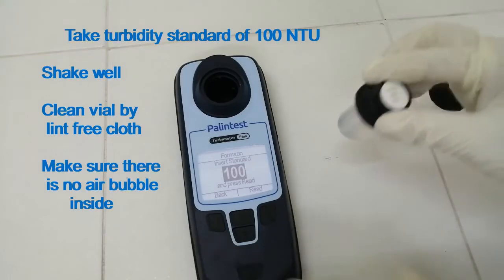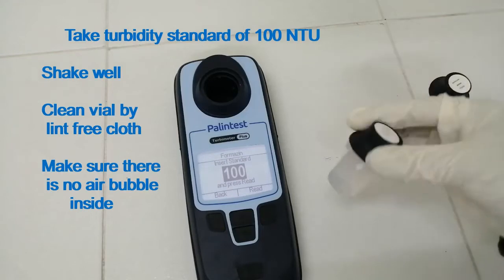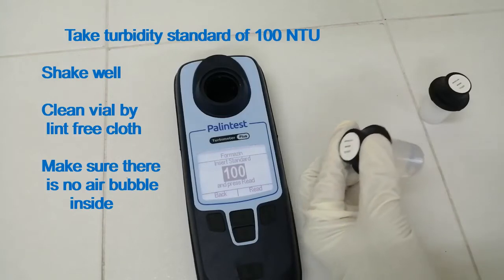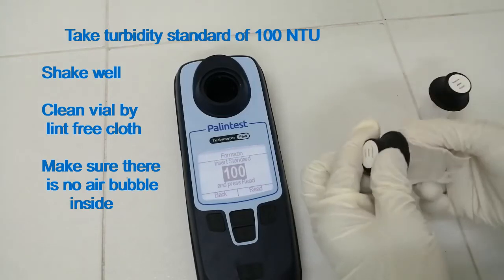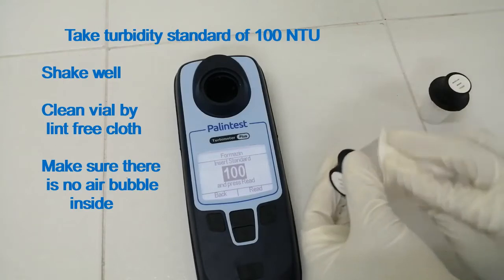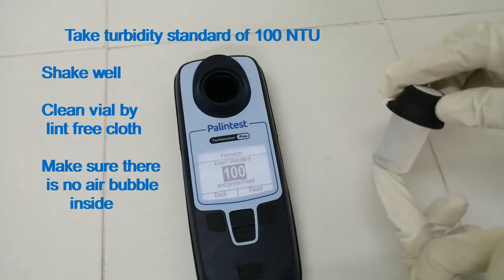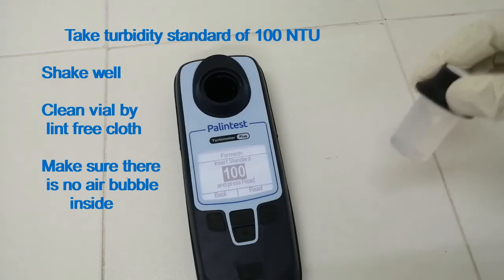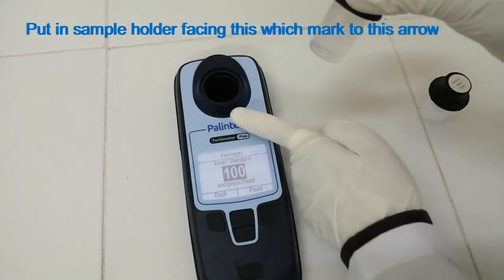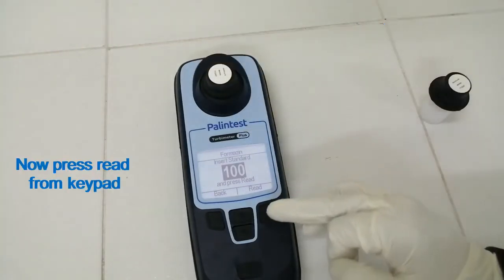Take the turbidity standard of 100 NTU and shake well. Clean the vial with the lint-free cloth. Make sure there is no air bubble inside the vial. Put it in the sample holder facing the white mark to the arrow. Now press Read from the keypad.